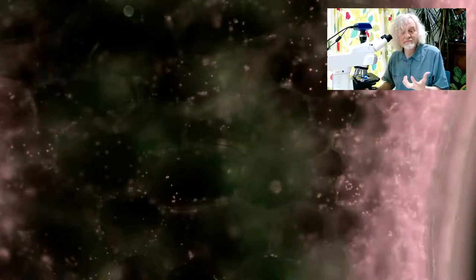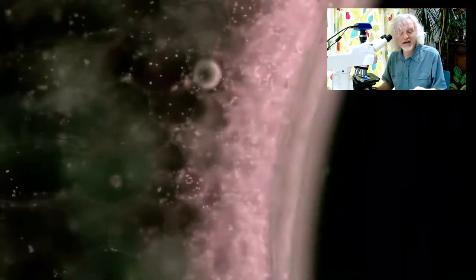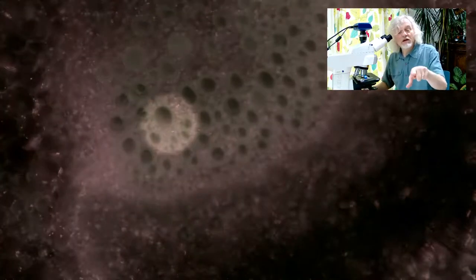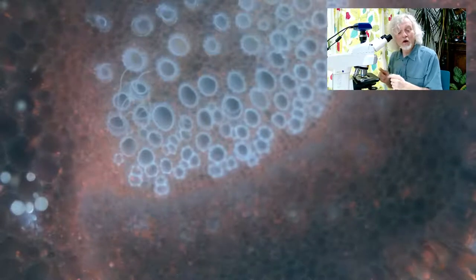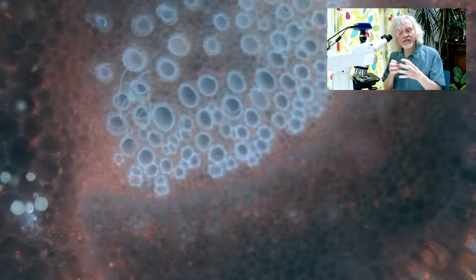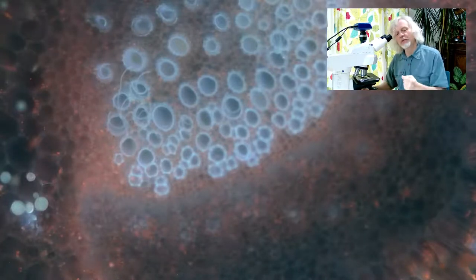Now, if I go in from here, to where the parenchyma, the main bulk of the celery doesn't really have much in it in the way of chloroplasts. But if you go into the xylem and phloem, I get myself in the center. There's quite a lot of it there. If I get focused right on the surface, you can see there's quite a lot of this stuff, but not in the big circular xylem vessels, the tubes that take the water up, and also not in the phloem itself that's passing the stuff down. Now, if I change the wavelength of light, I will illuminate a different type. I get a completely different sort of pattern. And this is now showing me where the thickening is. This is now making the lignin, which is the stuff that wood is made of, the really tough stuff. And it shows up really well in the xylem vessels.